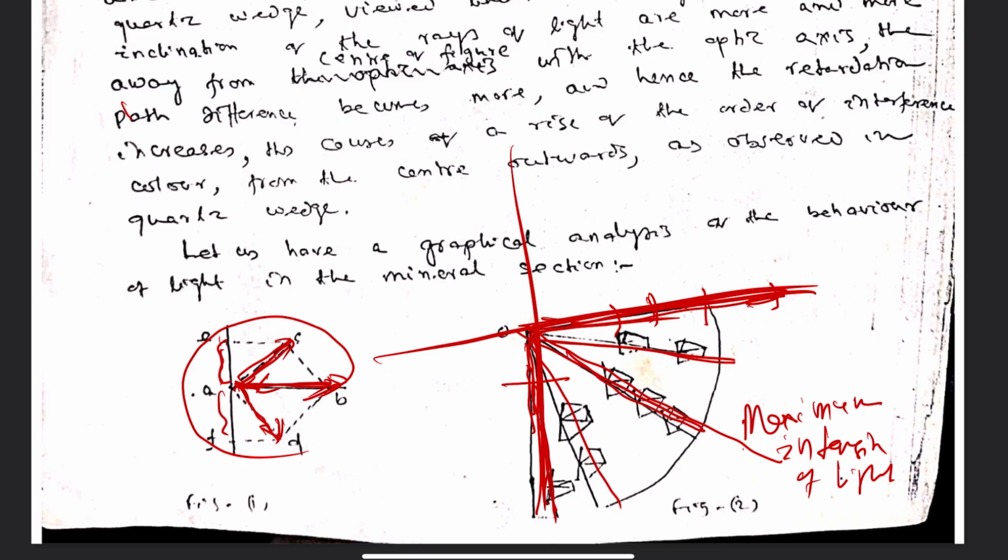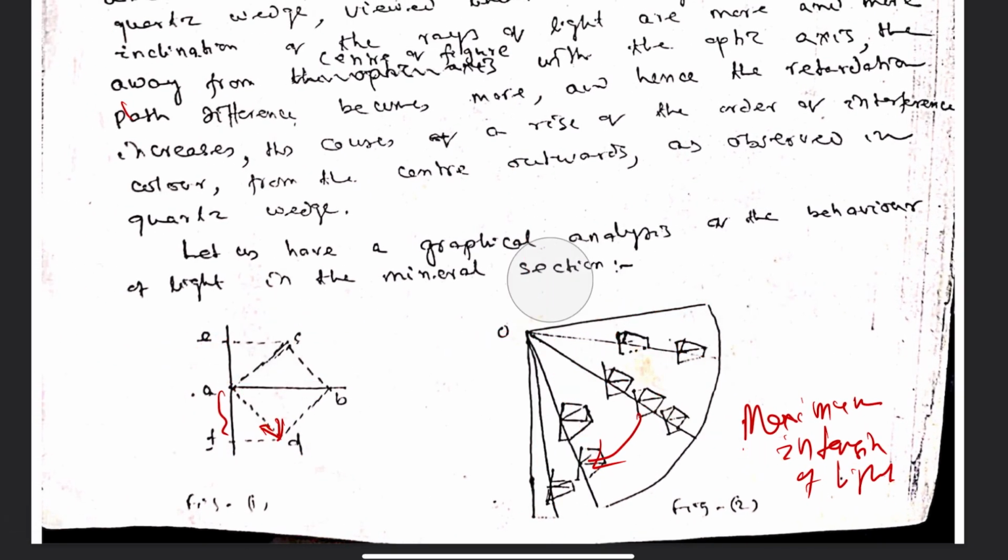As we move from this line in this direction, the intensity of light gradually fades and finally becomes 0 here. So this is the dark line. Thus, the maximum brightness line is the 45-degree line. Maximum intensity is along the 45-degree line. This fact has been described here.